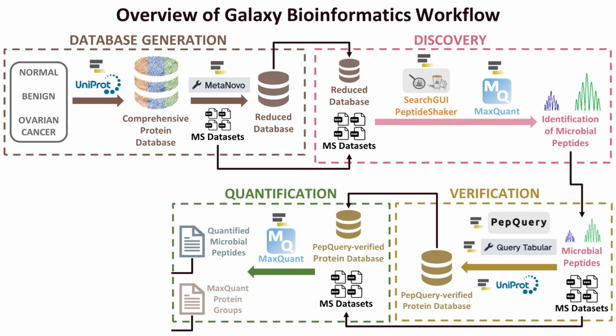It can allow researchers to decipher complex protein expression and protein regulation, which can provide insights into quantitative changes across different experimental conditions. Quantification also provides an additional quality control measure by validating initial protein identification and providing data normalization for increased accuracy.